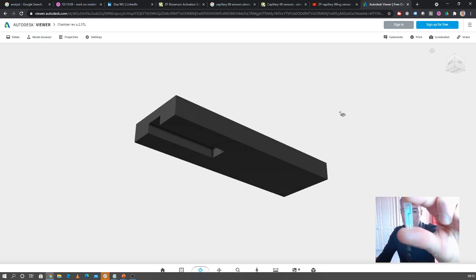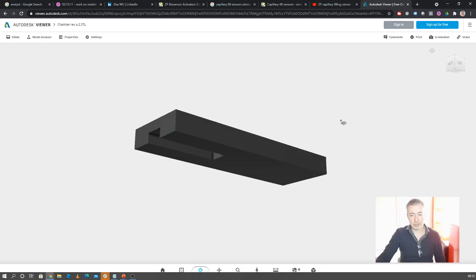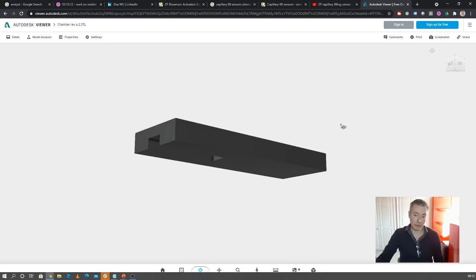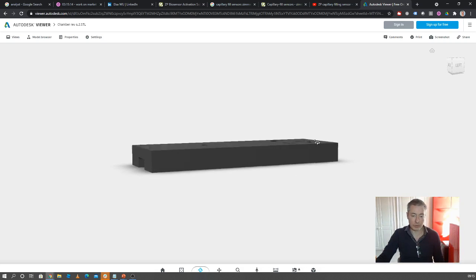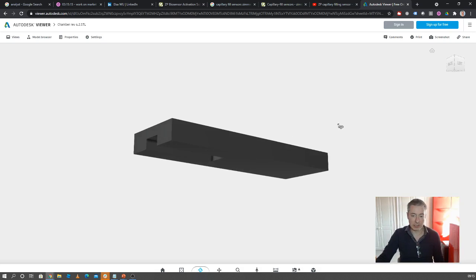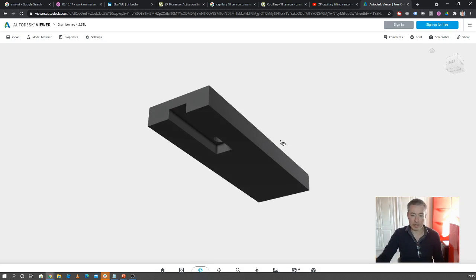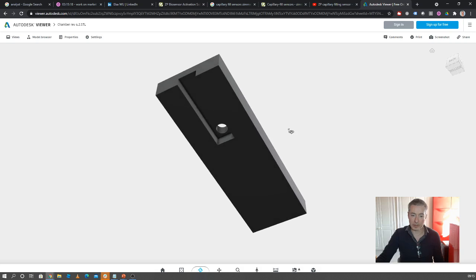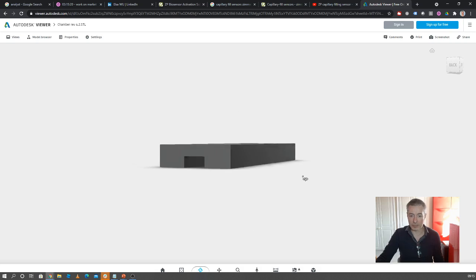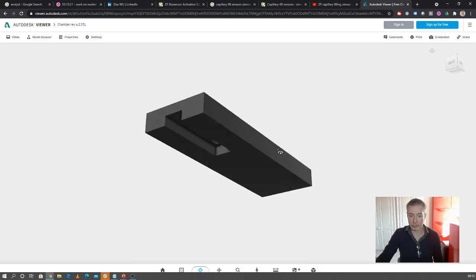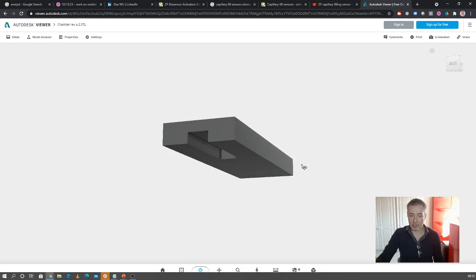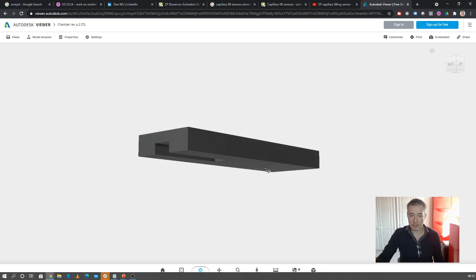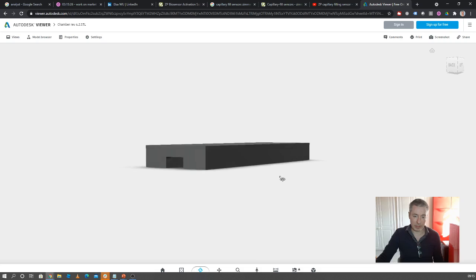Now a screen printer electrode you can turn into a biosensor, but it's really useful if you can actually put a microfluidic chamber above it because now you can control the volume of solution and you can also with a chamber like this it will allow you to do something called capillary fill.